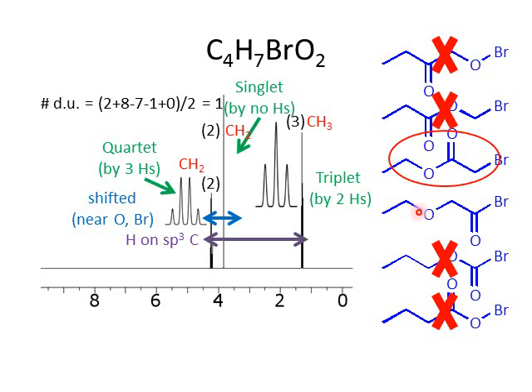You might look at this further and say that some things seem odd about this structure, like this functional group is one you've not seen. You haven't seen it where there's a CO double bond with a bromine directly connected. You might have some chemical intuition that you haven't seen that before, and that's probably because that sort of thing would be quite unstable. That's true, and that's pretty good reasoning as well, whereas this thing seems more in keeping with some of the things that we know about the stability of different structures. But that might be a little bit advanced right at this stage of the game.